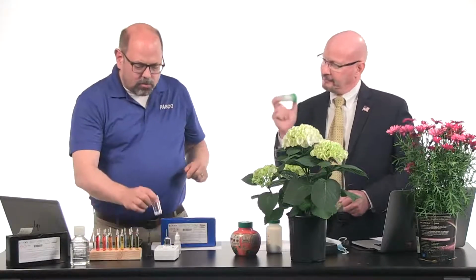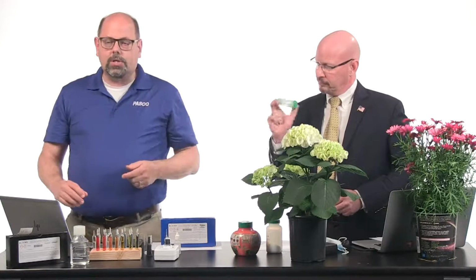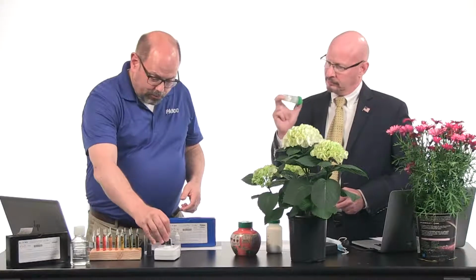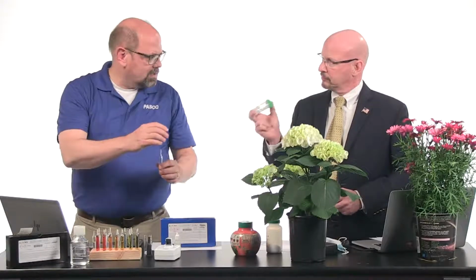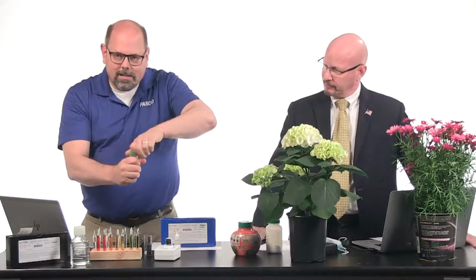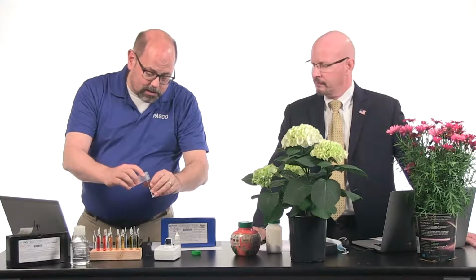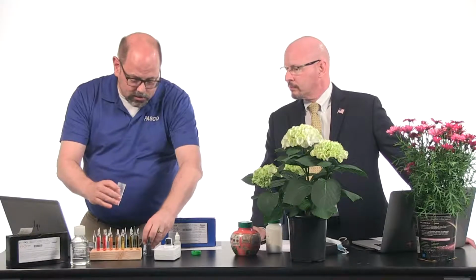And what this will do, the zinc is going to help to catalyze what nitrogen is in there so that it's in a reactive form. And then we're going to go ahead and mix that with the acid so that when we mix, here's our pre-mixed chemicals in this little vial. And I'm going to say we're probably just fine in terms of our illustration purposes. Again, follow the timing on there is nice. We're going to take that catalyzed sort of solution. We're going to pour it out, leaving the zinc behind on top of that fixing solution that was in there.